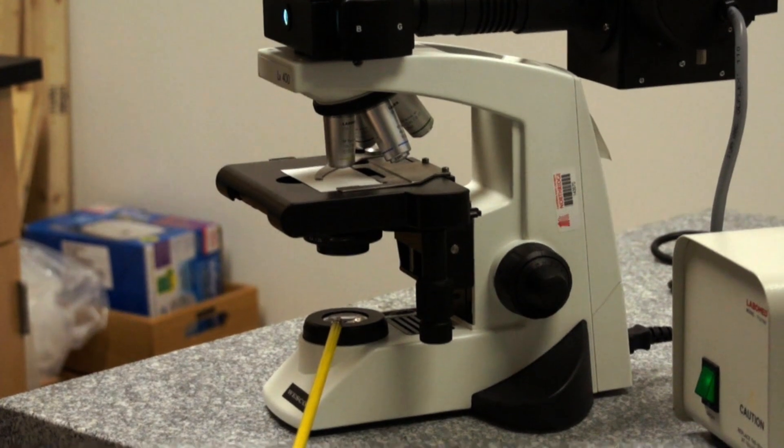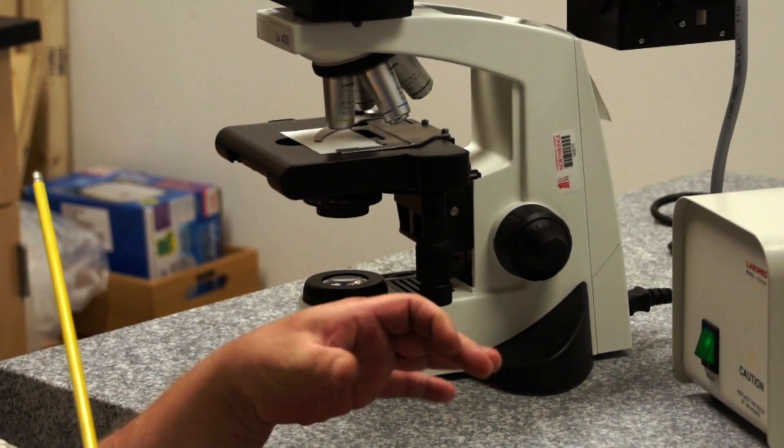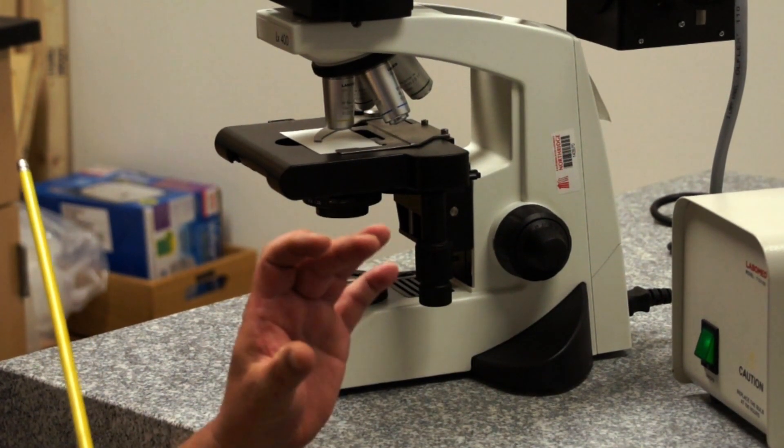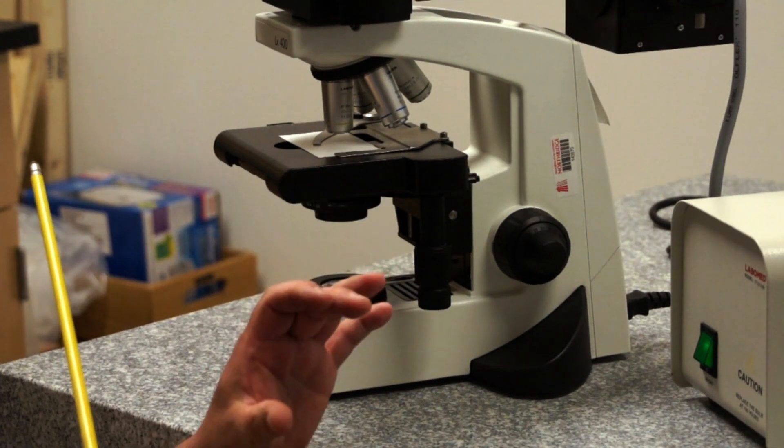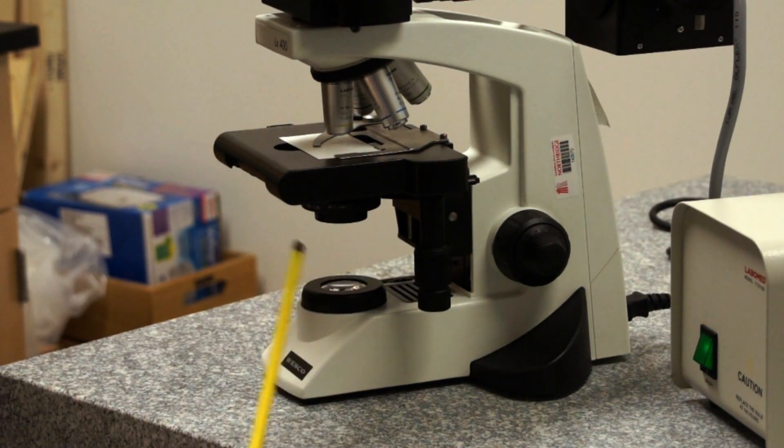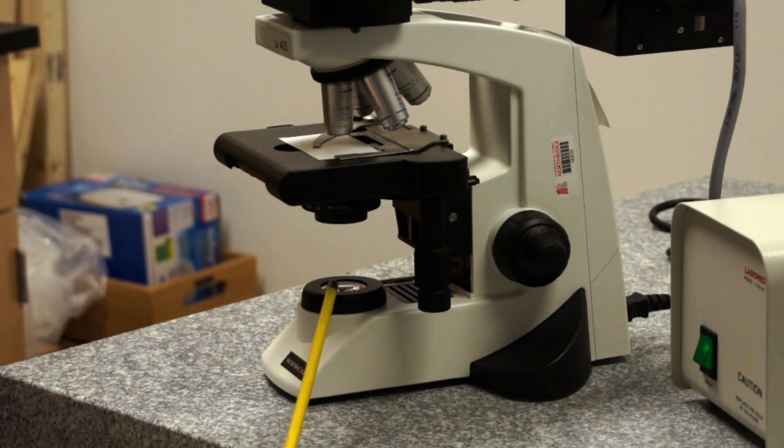The field diaphragm is important, remember, because when we close it down we can see it in the field of view, and it's also important for alignment. We'll show you how to perform that alignment in another section.